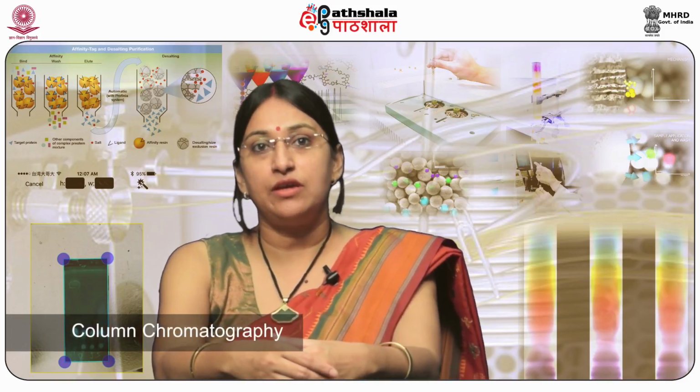Column chromatography. In column chromatography, the sample mixture is passed through a column packed with stationary phase material. The mobile phase is passed through the column at a certain flow rate. Using proper solvents and packing conditions, the components in the sample dissolve in the mobile phase and travel through the column. The analytes which are dissolved early are eluted out of the column first, then those which are dissolved late, resulting in the desired separation.